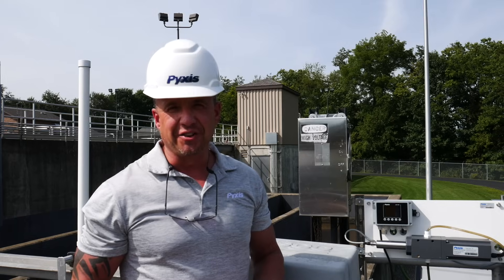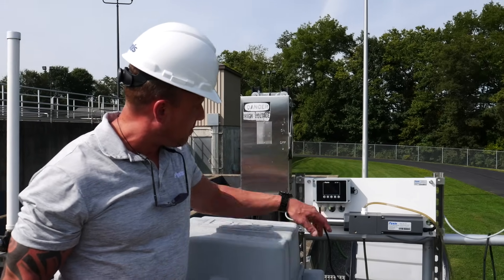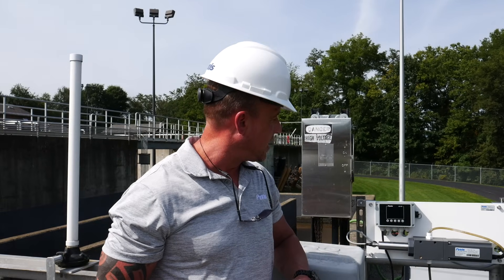It's a little bit sunny here today so it's challenging to see the screen on camera, but I can see currently our system is operating at .001 as residual chlorine and a pH of 7.16.